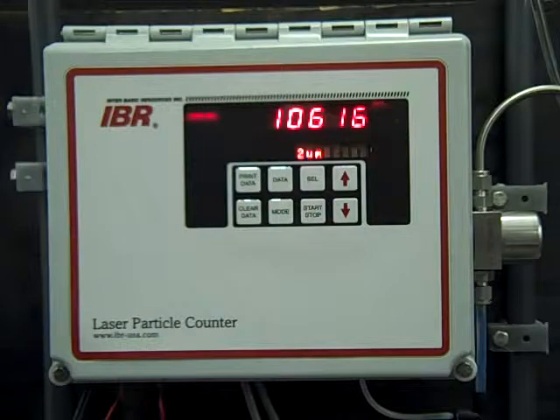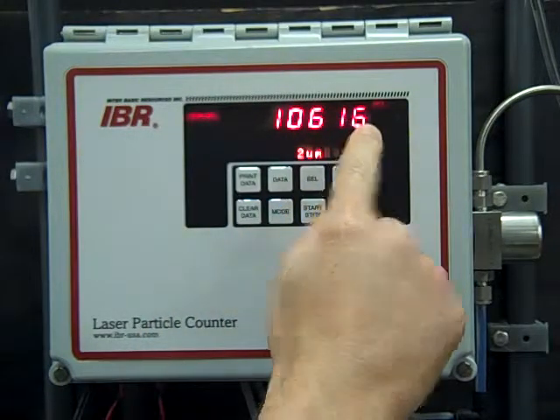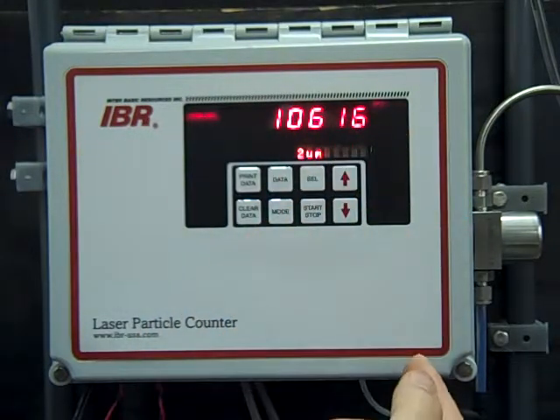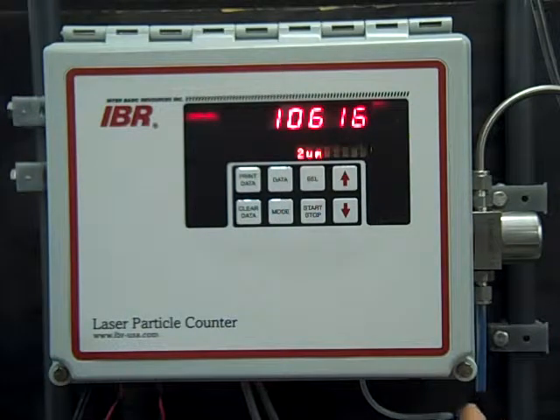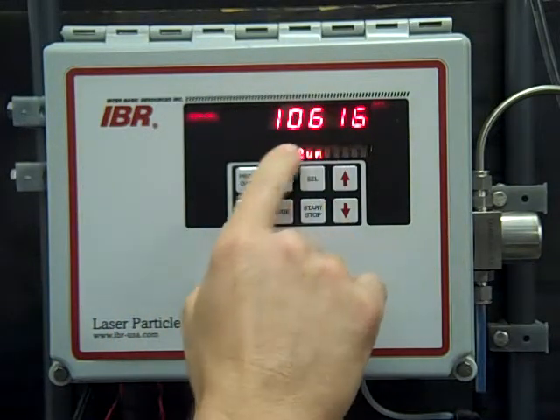A more useful way of displaying particle counts is counts per ml. So if you take this number and divide it by the volume of water that went through the sensor in that 10 seconds time period, that volume of water in this case is 10 milliliters.